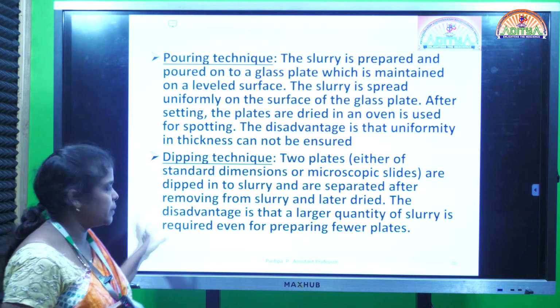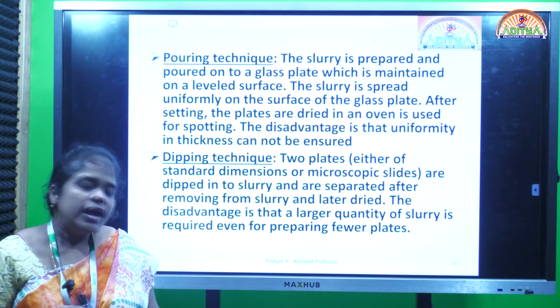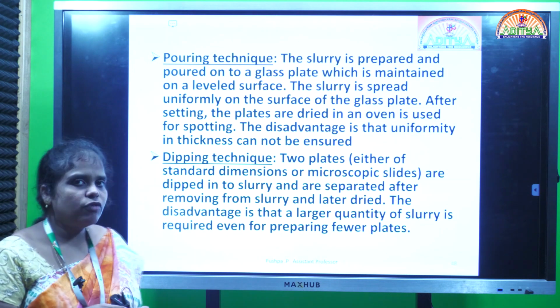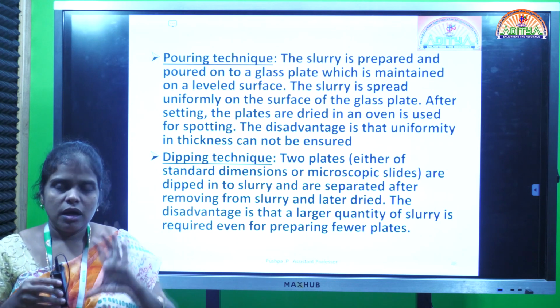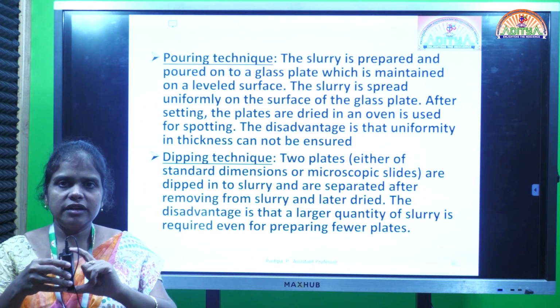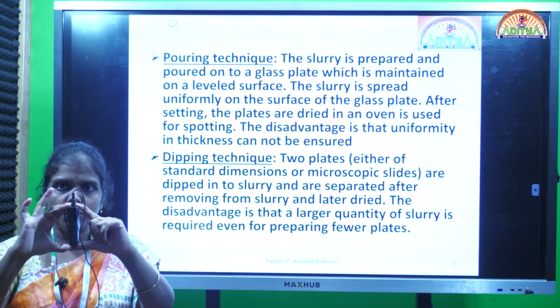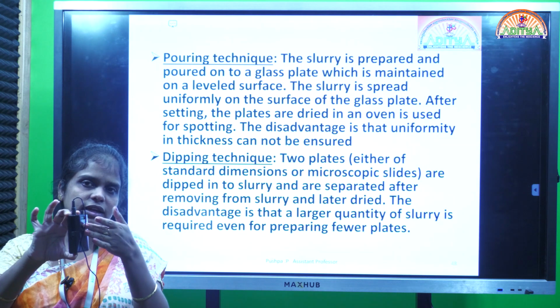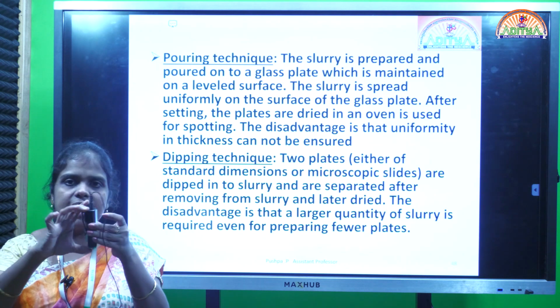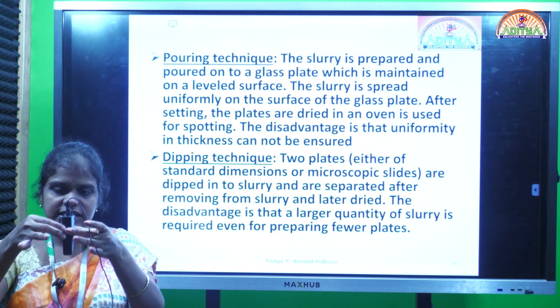And the next one is the dipping technique. The name itself denotes that we will dip something. Here in the dipping technique, we have to take two TLC glass plates. We have to attach both like this. See, you think that this is one TLC plate and this is another TLC plate. Both TLC plates we have to attach like this.